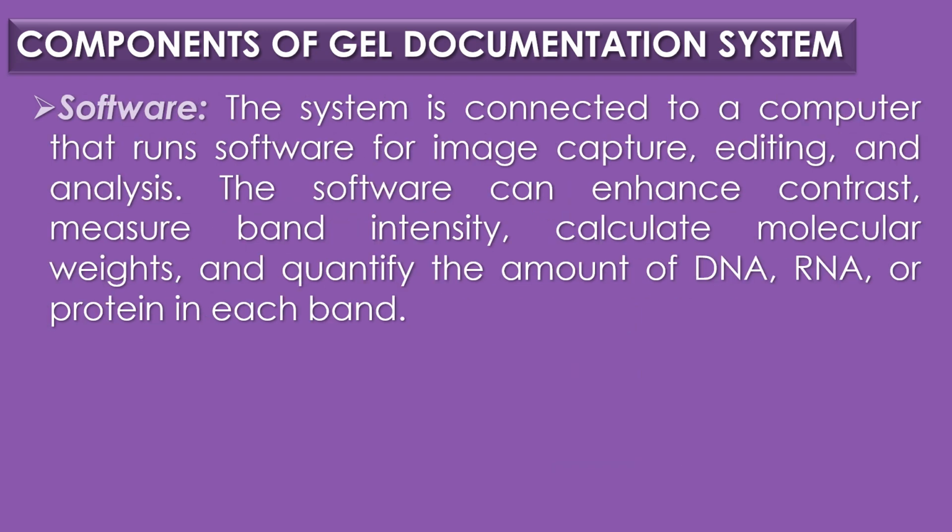The seventh component is software. The system is connected to a computer that runs software for image capture, editing and analysis. The software can enhance contrast, measure band intensity, calculate molecular weights and quantify the amount of DNA, RNA or protein in each band.